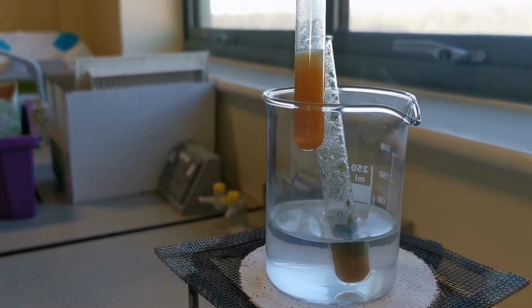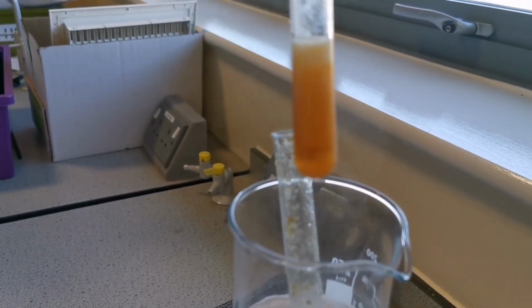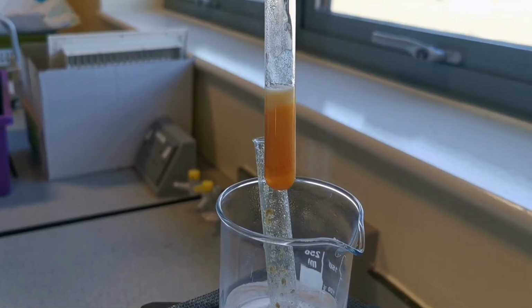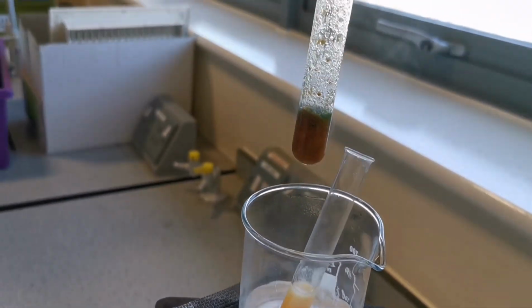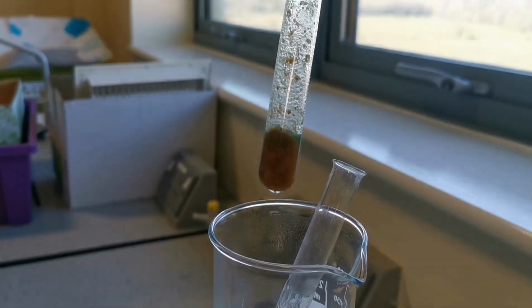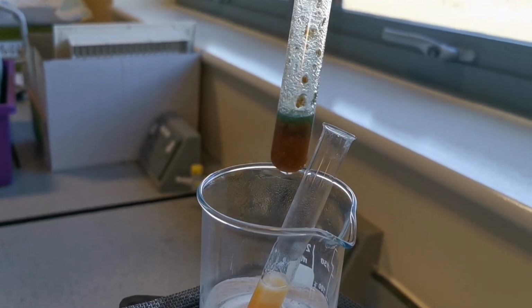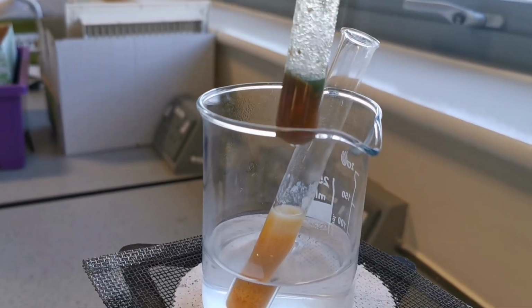Here are our results. So this is the final result for our milk. Obviously it started off blue and it has turned quite a bright orange colour there. So plenty of sugar there in our milk, which may surprise some of you. You've got the biscuit, probably not as surprising that a digestive, something like that, would contain quite a lot of sugar. Although it's not as red as it possibly could be with some foods, possibly sweets and chocolate.